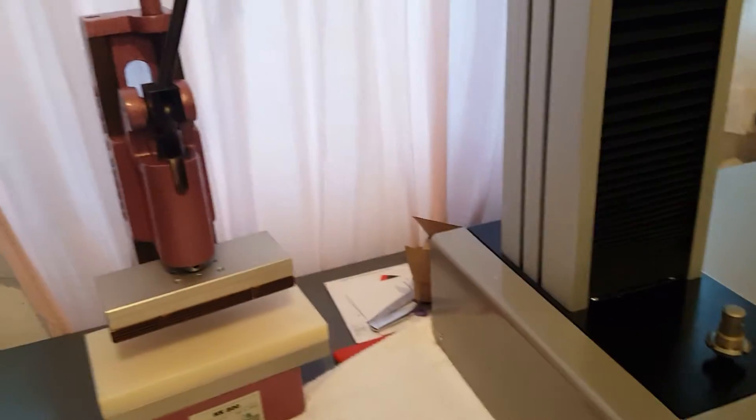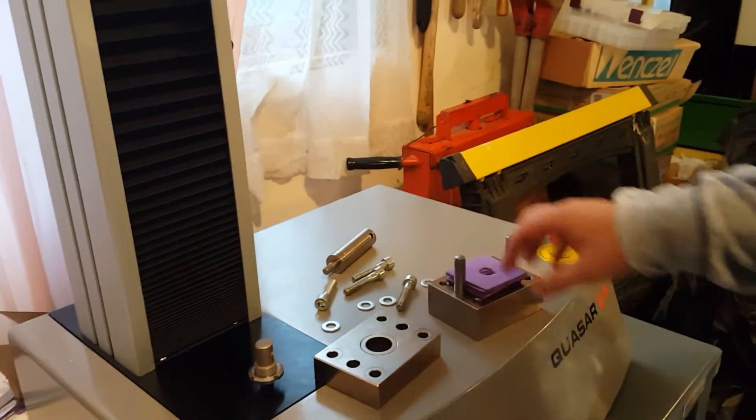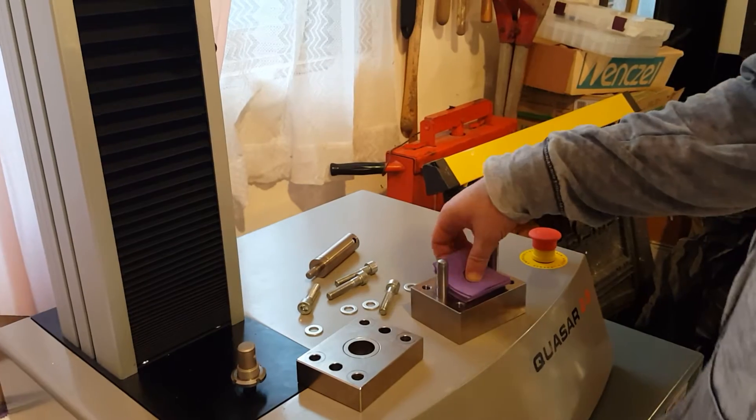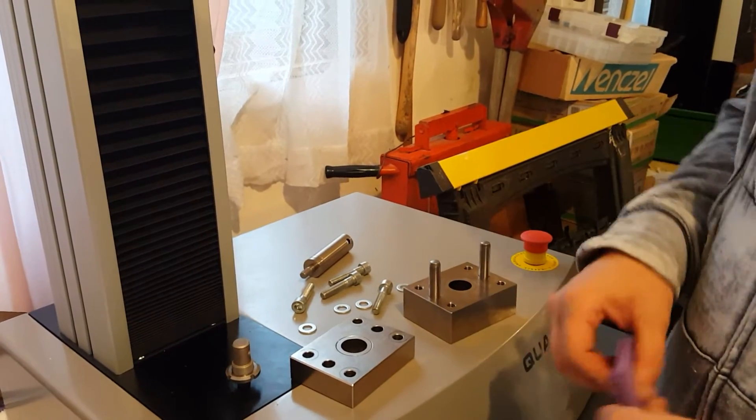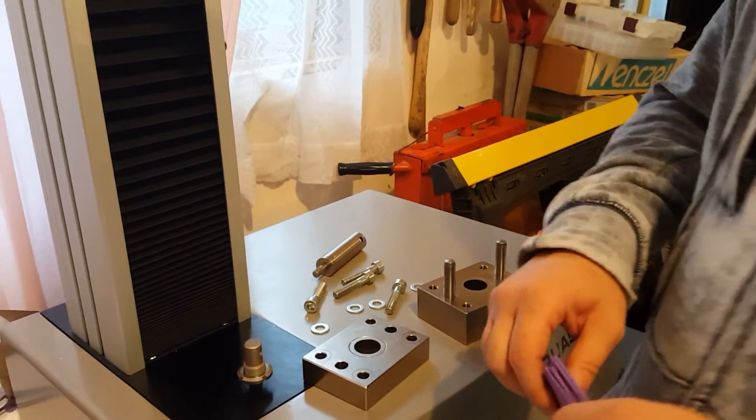There we go. Hello, today we are demonstrating the ASTM D732 shear fixture for plastics.